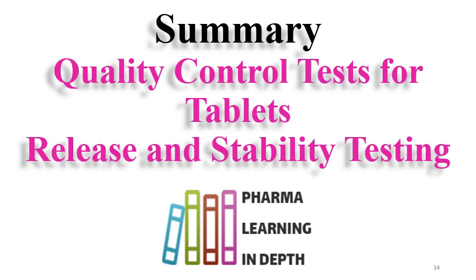Similar tests are there for capsule formulations as well. Only the hardness testing is not done on capsules. So the same testing is done for capsule formulation as well. Also, soft gelatin capsules are tested in the same way. The assay, RS, dissolution, and water content, these are the prime important tests for oral solid formulations.